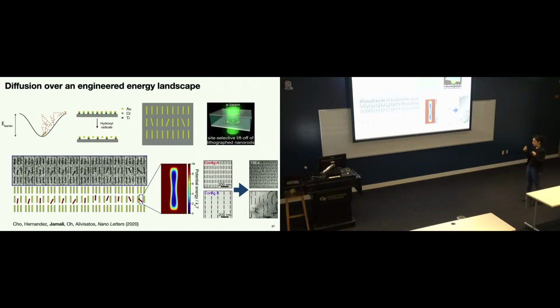But that's just a beginning to thinking about TEMs as not just passive characterization tools, but engineering tools, and not just simple engineering, but potentially automated engineering tools, like robotic experimentation tools. Once you have particles that respond to the electron beam, in this case you can etch off the base of the nanorod, but in cases that we are continuing to work on right now in my group, we have particles whose motion responds to the electron beam of the microscope. And so we can guide their motion by manipulating the electron beam of the microscope.